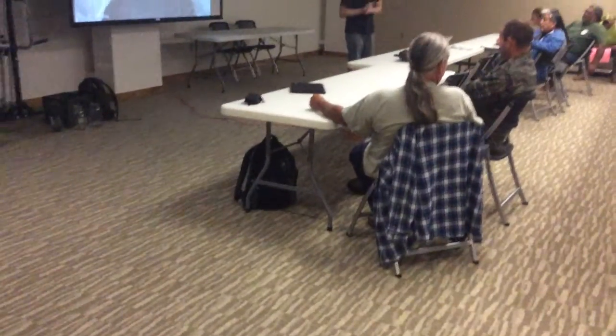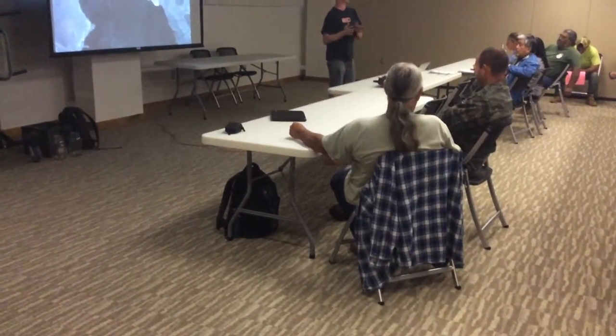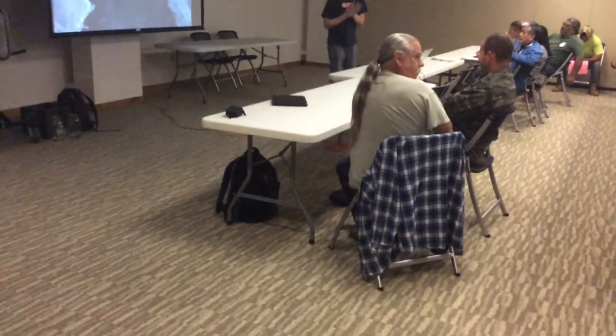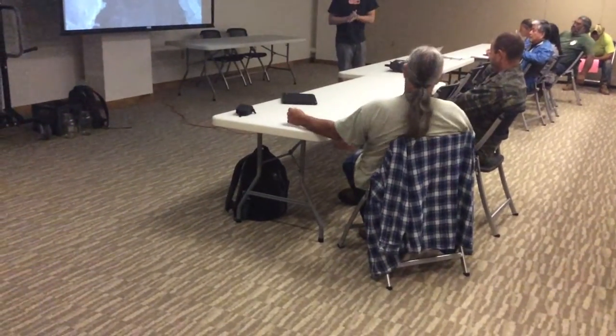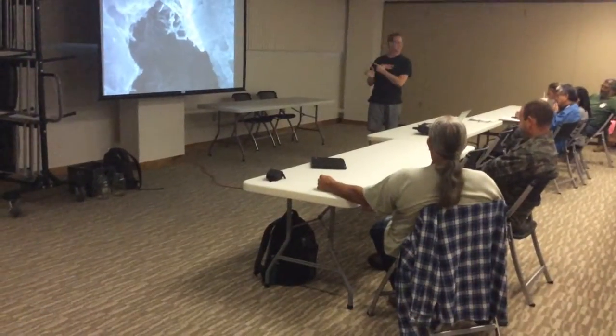And UH said, hey, why don't you just come on in - I know you're not around the machine, we'll come in and get you situated - and I was able to take pictures over the course of about four days. And so it was all donated through UH, thank you very much. And this is not cheap.